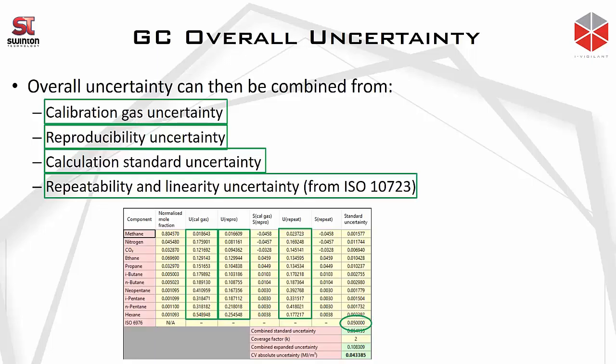We had a case of neopentane that had an uncertainty of 300%, and the only reason why it has 300% of variation in there is because the neopentane component was 20 ppm. So it's a very, very low component, and therefore it gives a very, very low sensitivity towards the measurement, and it doesn't really impact the uncertainty at all.